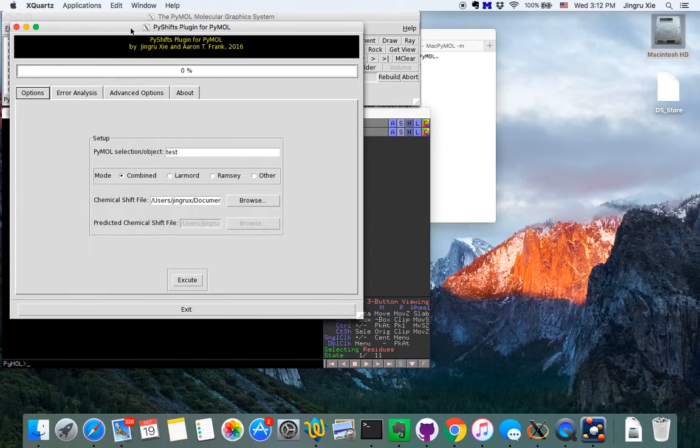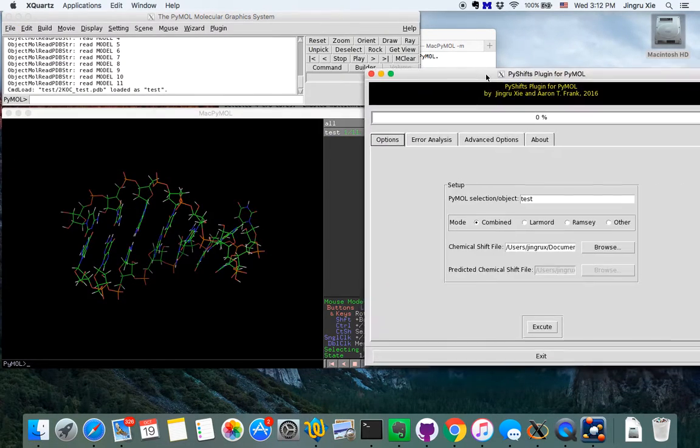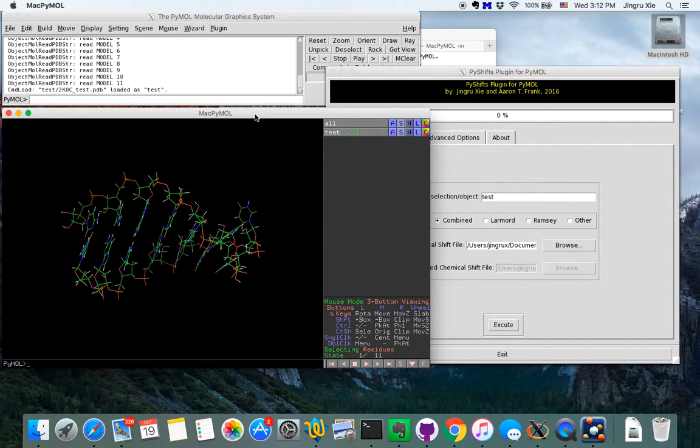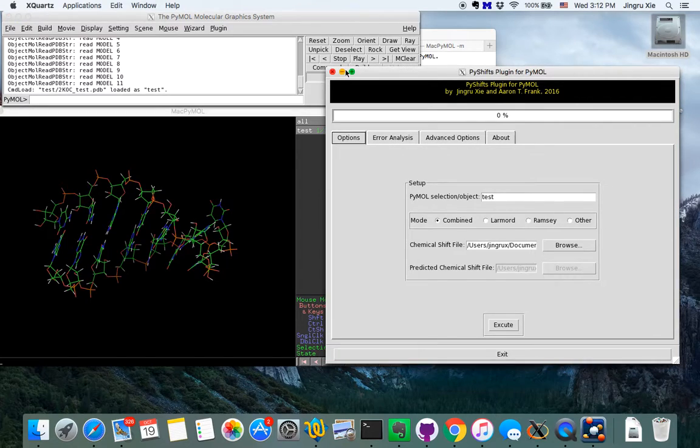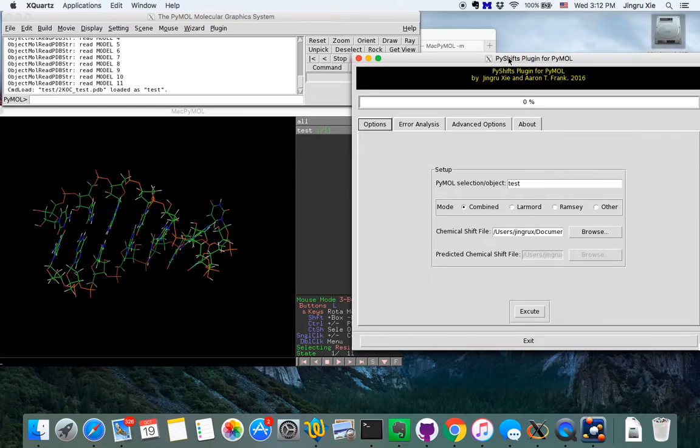So here in this window, you can see there are a few tabs: the options, error analysis, and advanced options, and there's also an about. So in this video, the basic use, I'll only talk about the options and error analysis.